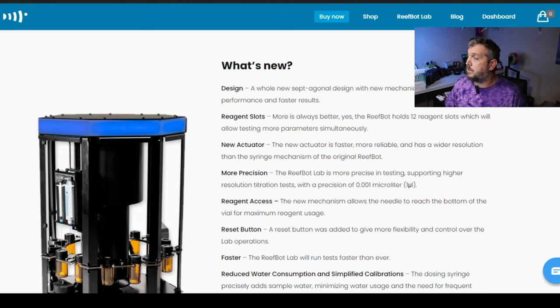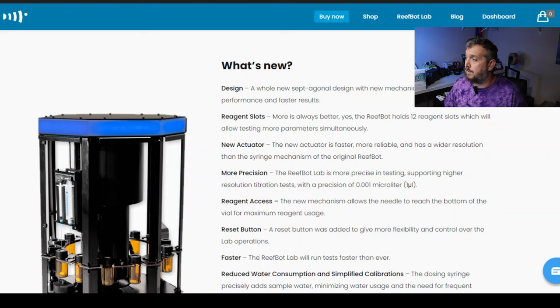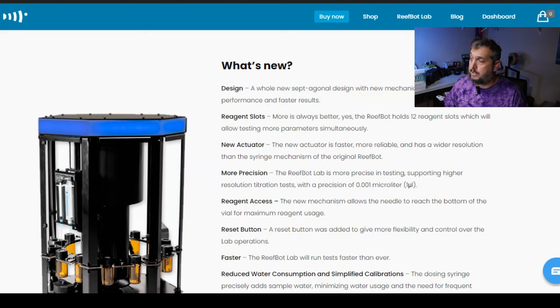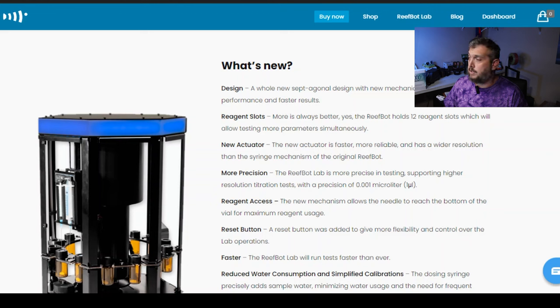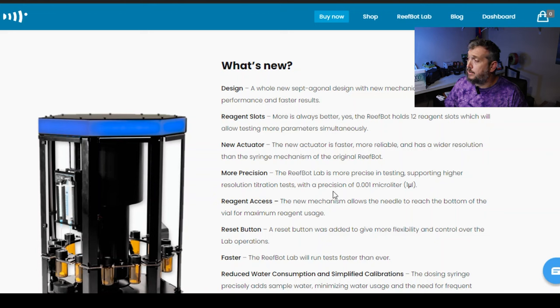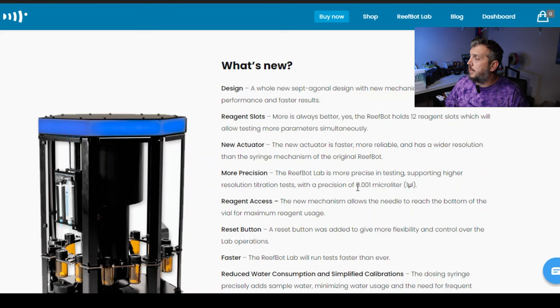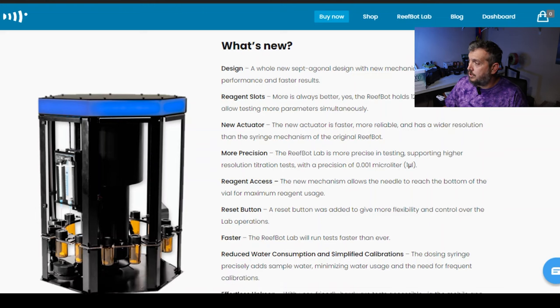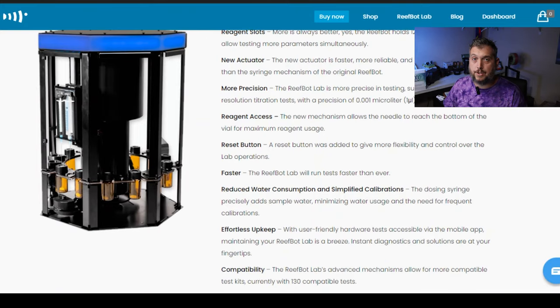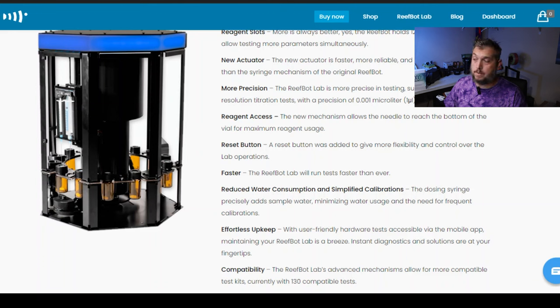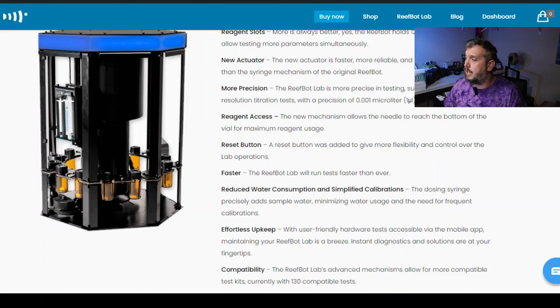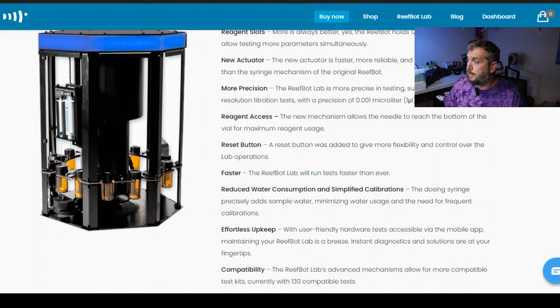However, when you are doing these tests, you may or may not be home while the ReefBot is performing a test. So while this can test faster, which is great, it never bothered me how slow or fast the ReefBot version 2 came up with the test results. Because you just schedule it and your phone will tell you when the test is done. So I didn't see that as a problem before. And it's exciting that you can get faster results and enhanced performance out of this new one. Reagent slots, of course. The ReefBot holds 12 reagent slots versus the 8 from before. It has a brand new actuator that's faster and more reliable with a wider resolution than the original ReefBot. So more accurate, more precision testing right here, supporting a precision of 0.001 microliters.